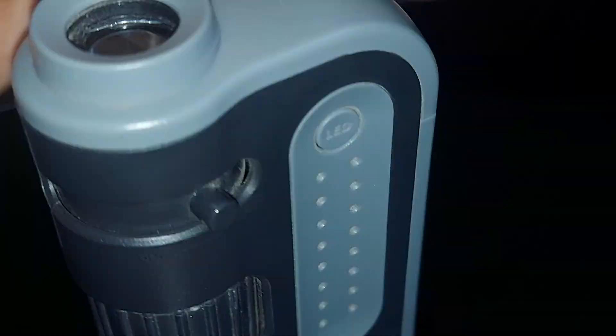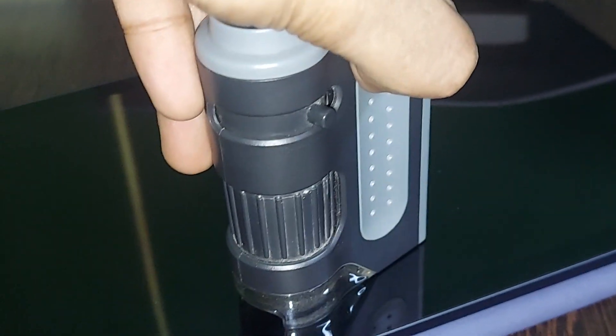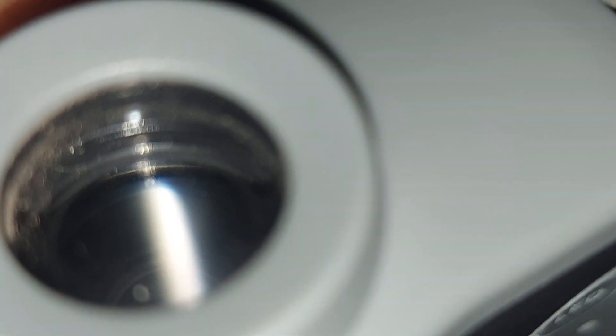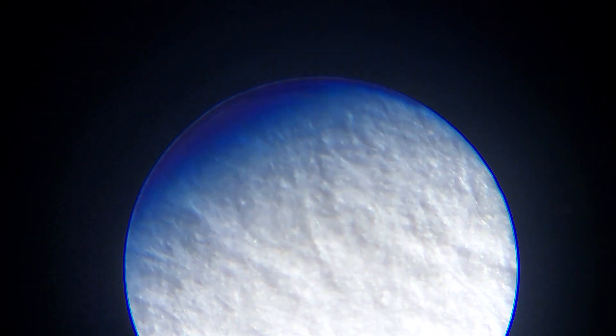I can put the object at the bottom and turn on the light from here. As you can see, this will turn on the light. Put the subject here, focus it, zoom it, and see the object. So let me show you something — this is actually a paper sheet.